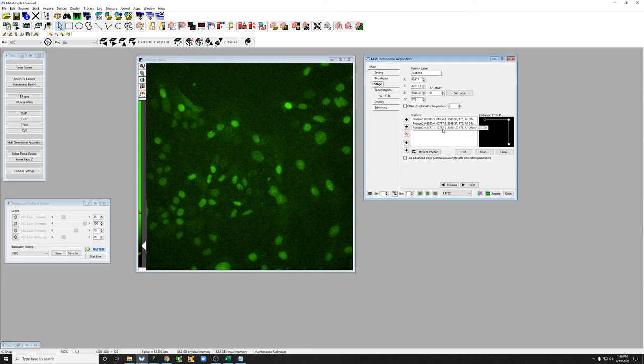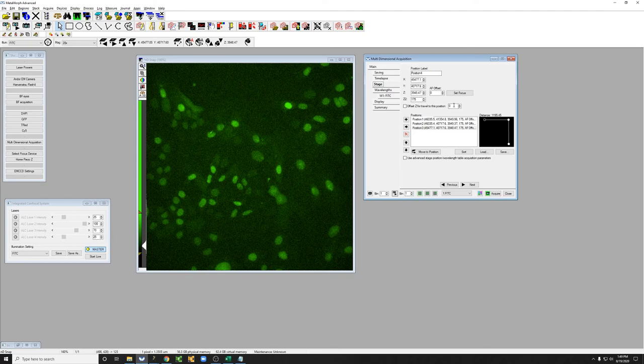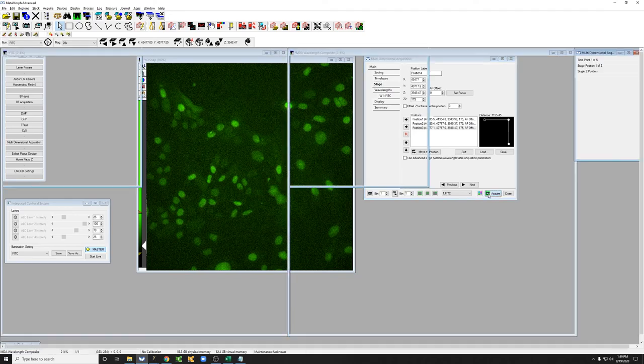So again, three positions noted here. Before I put each one, I clicked on set focus. The objective is not going to move as I do this. Let's hit acquire and see what happens.